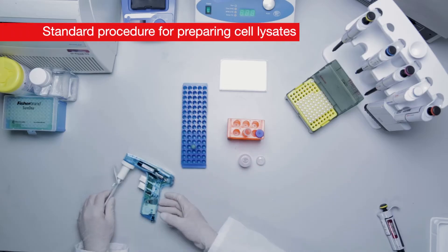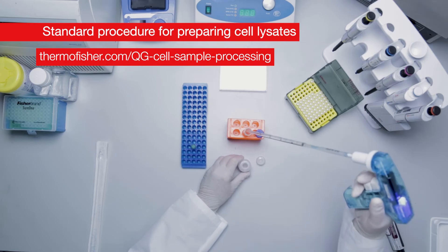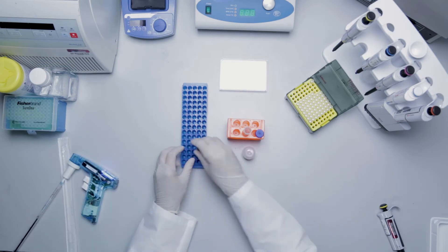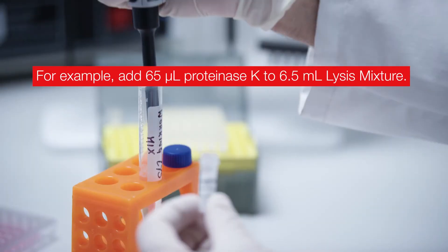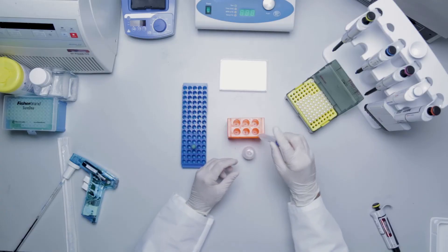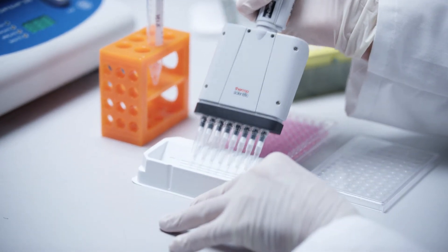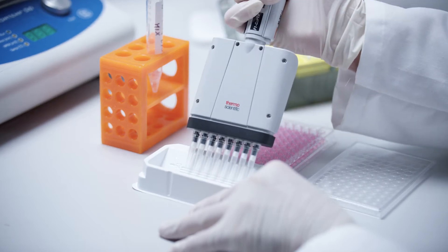First we will walk you through the standard procedure for preparing cell lysates according to the product information sheet for the QuantaGene sample processing kit for cultured cells. For this procedure, add lysis mixture directly to the media. First, prepare the working lysis mixture by adding 10 microliters of proteinase K to each milliliter of lysis mixture required. Make sure to always reach a final working solution of lysis mixture of 33 percent. In this example, add 50 microliters of working lysis mixture to 100 microliters of cells in cultured media per well.